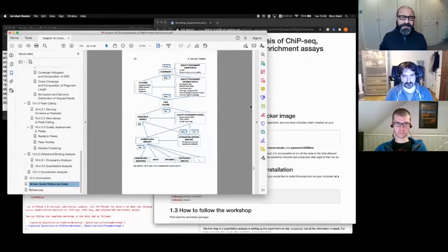But what we know is that there's more variance, technical variance, in running a ChIP or an ATAC than there is in running RNA-seq experiments. If you take the exact same sample, a very homogeneous sample like a cell line, and run the exact same RNA-seq in multiple replicates, the variance is pretty well controlled, especially if it's the same person doing it.